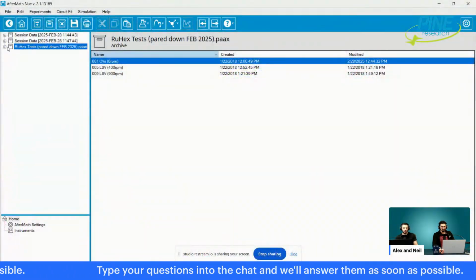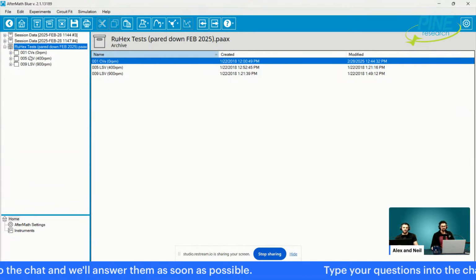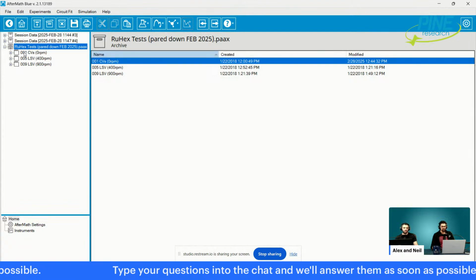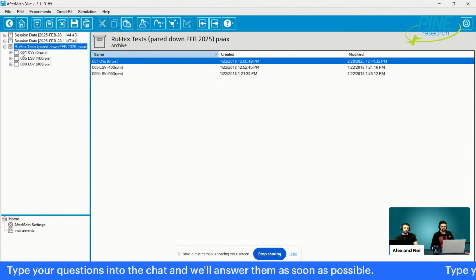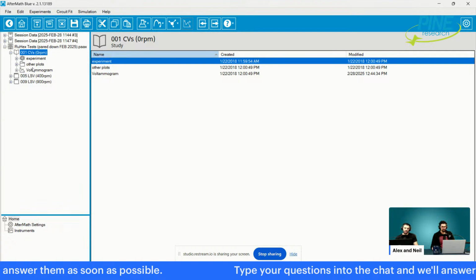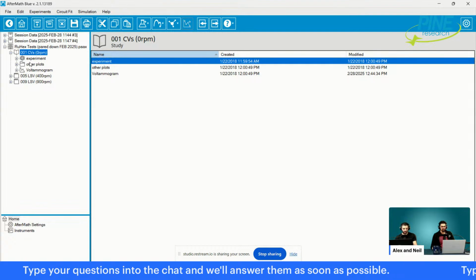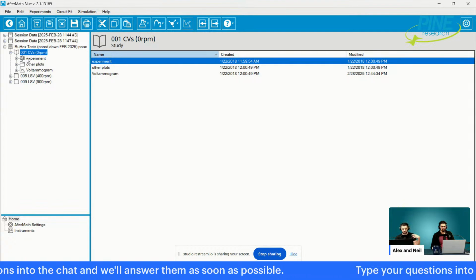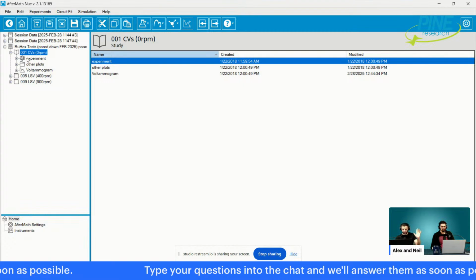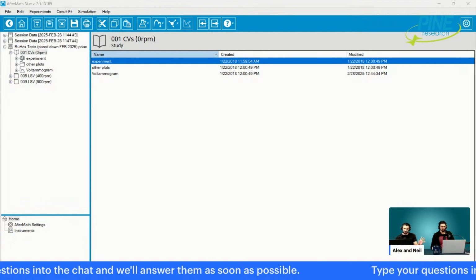Okay. So what I have here is ruthenium hexamine. It's like the next best thing, in my opinion, to ferrocene. Ferrocene's like a perfect 1 electron, super well behaved, non-aqueous redox couple. Ruthenium hexamine works in aqueous, and it's a little bit easier to work with when you don't have complicated lab equipment, like a full scale laboratory with acetonitrile and ferrocene to go moisture-free, glove box, all the things, right? So Dooley's, you had asked about ferrocene, can't help you, but I got Ruhex, that's the next best thing.